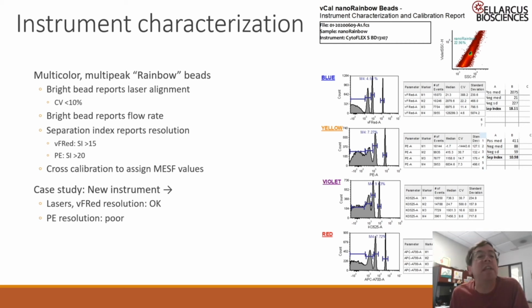at least 15. And for immunofluorescence, one can do a similar thing. So PE, which is probably the best, brightest stain for immunofluorescence of EVs, we can set a threshold there. These fluorescence beads can be cross-calibrated against MESF standards so that we can report our brightnesses in those values.